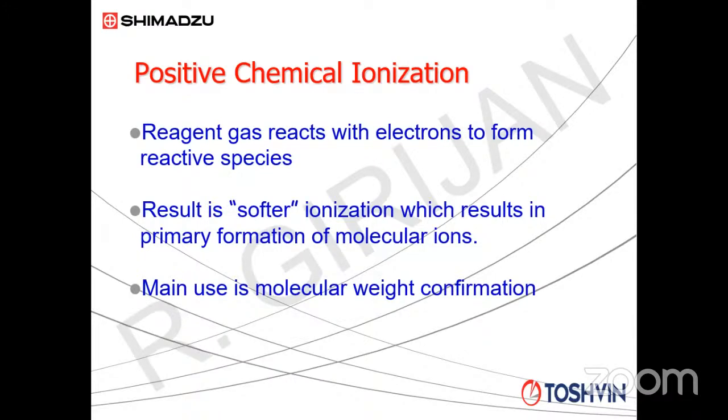Otherwise, it is not very commonly used. The selection will be between isobutane and methane, but isobutane is costly. So people normally prefer to go for high purity methane. Methane is not that costly either. So why this reagent gas is required is what we do before injecting the sample.